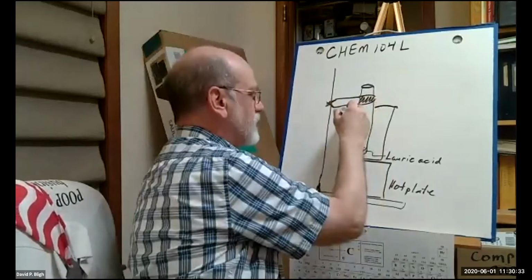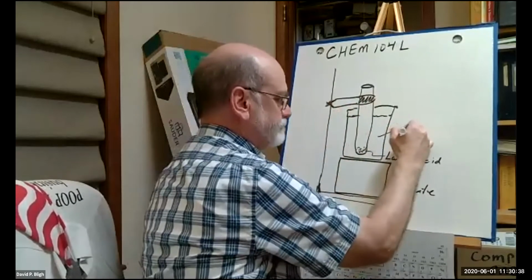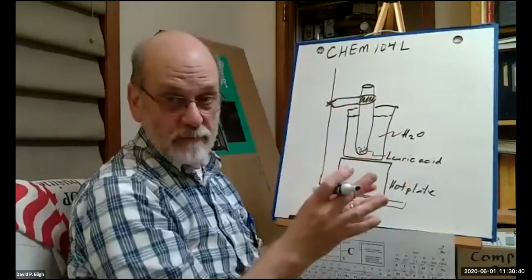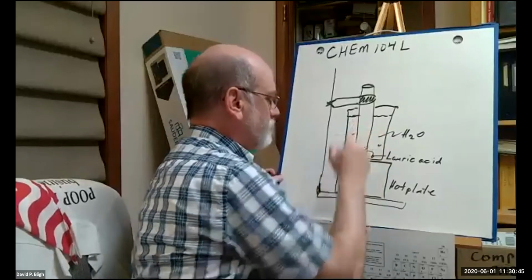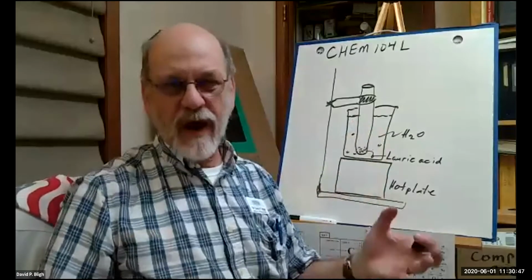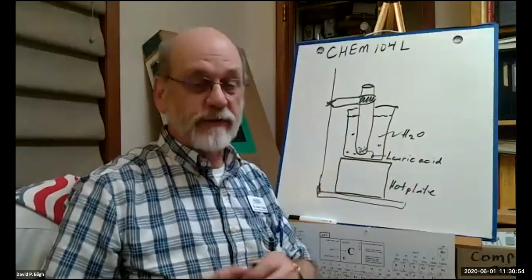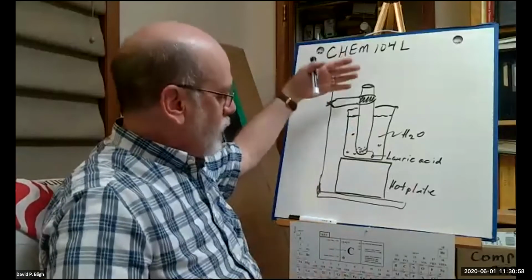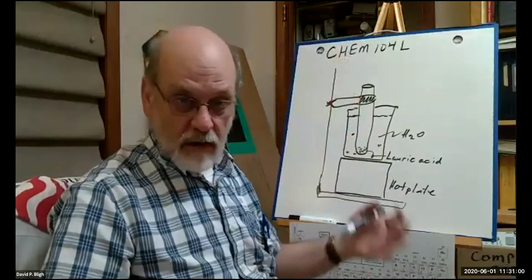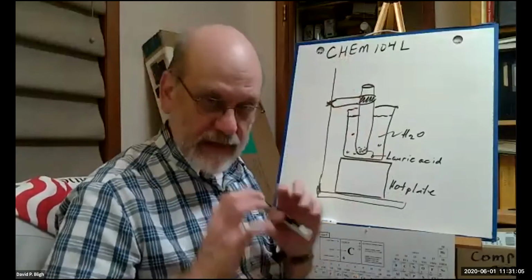There's our beaker with water. That's it. Pure water, but the water is boiling. Right? So at our altitude, it's probably 97 or 98 degrees. It's definitely hot enough. And we submerge the lauric acid in the hot water and let it melt.